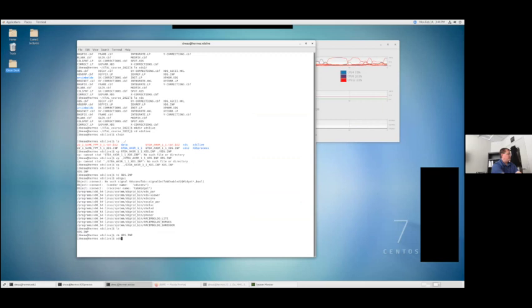So XDS GUI, and this is a case if you're using VPN to connect to, and then SSH to connect to the lab computer, for instance, you'd want to make sure that you enable that X11 forwarding that I talked about in the two little articles in Classroom on how to connect to the group desktop from either a Windows or a Mac machine.